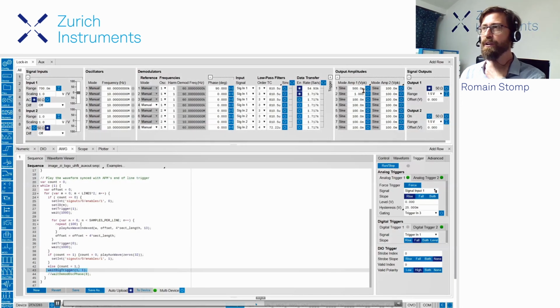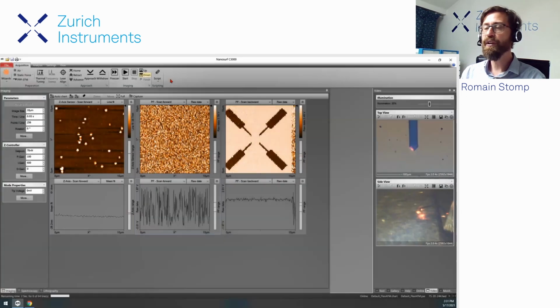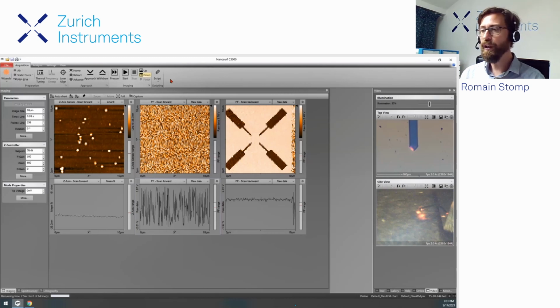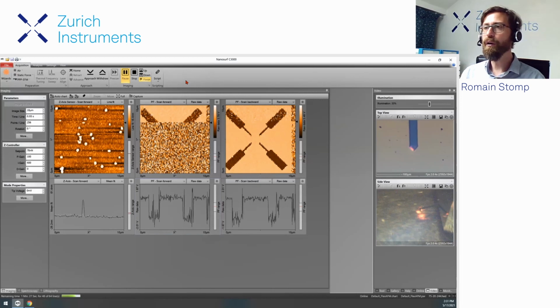And if I just go a little bit down, now we basically turn the AWG off because we want to convince ourselves that we did write everything and we have the same between forward and backward. So in this case, now there is no more AWG involved. It's just a standard static PFM, and we just go downward. And if you start to also build up the image, you see that forward and backward are obviously exactly the same, and we are exactly on top of what we had just written on the previous scan.